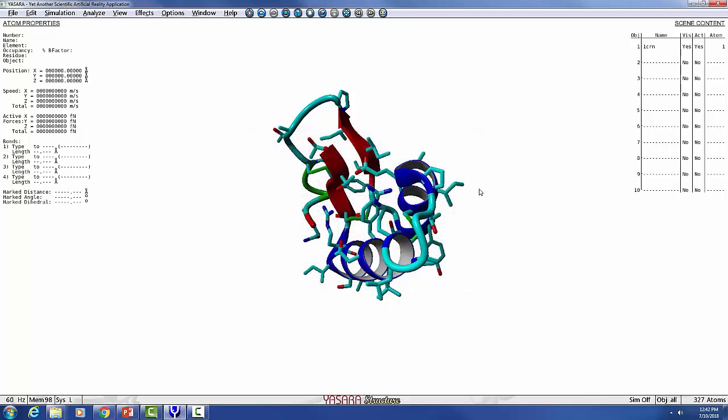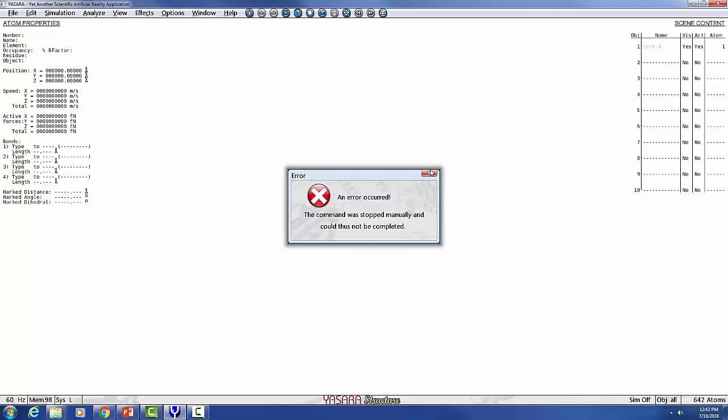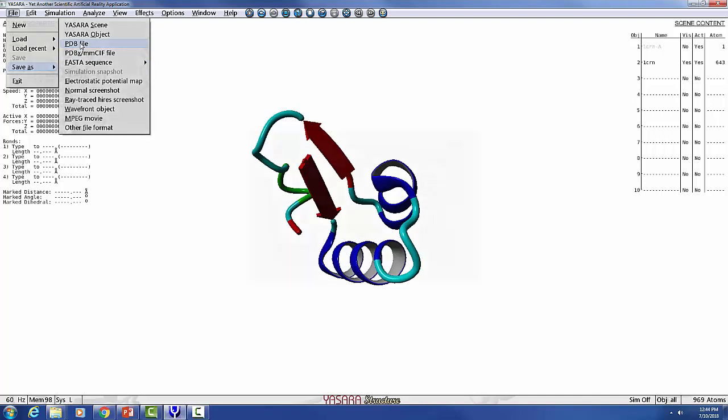All right, so you can do that, and you'll start going through a whole lot of analysis. And so I won't go through all this, and I won't let it run throughout, but you'll get to a point where you'll see the computer producing a bunch of images, and it's rotating and it's changing the structure. And so it's basically fitting the FASTA sequence of the amino acids into structures based off of homology of other proteins. When you're done with the structure, you need to save this and save as a PDB file.